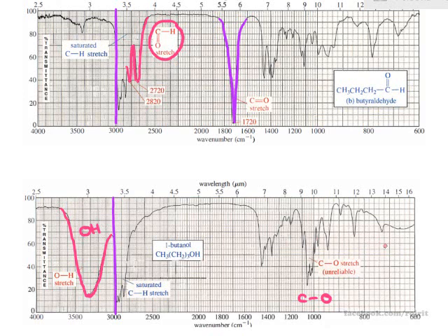As you may compare with the above structure, 1000 is around here, and you can see some peaks. So how can you be so sure that this is the CO single bond? Sometimes we cannot be very sure about that. But anyway, with the presence of the very broad and very strong absorption at 3300 here, you can be certain that this is the alcohol.